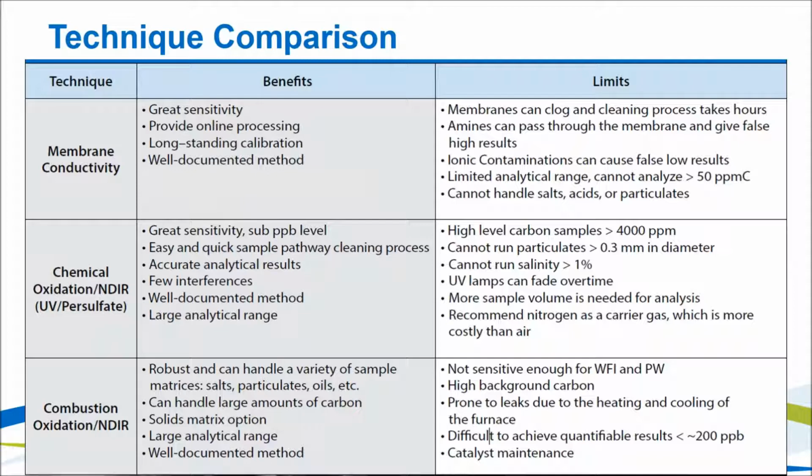Again, that's with dilution. So really, it's not a huge range if you run the sample straight, but we have auto dilution, all that kind of stuff associated with it to get you up to that 4,000 range.